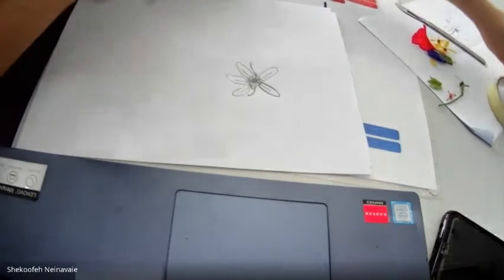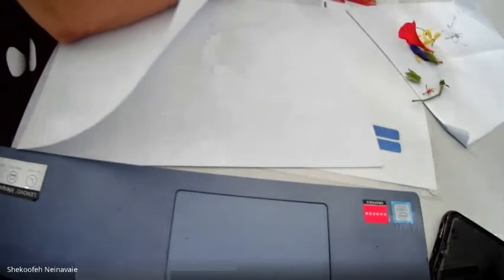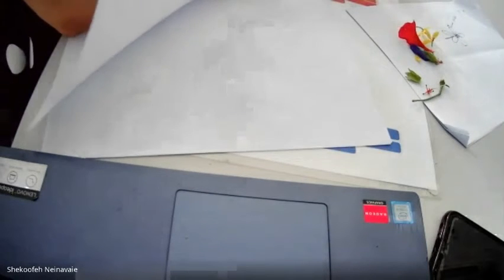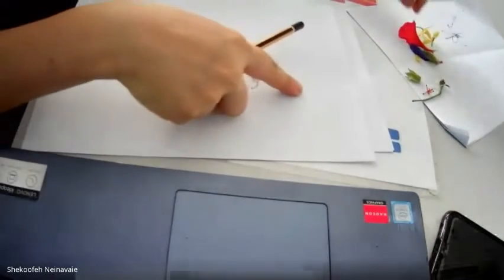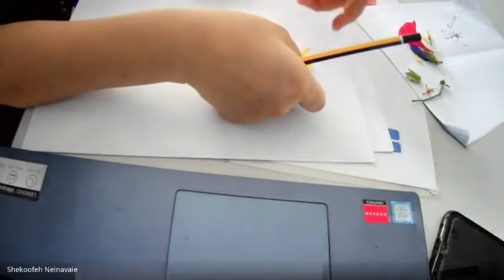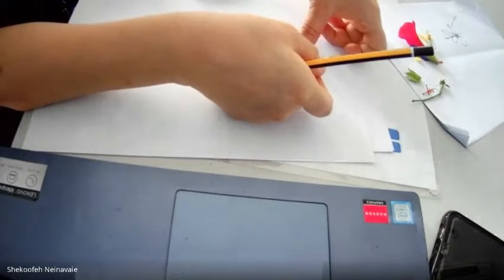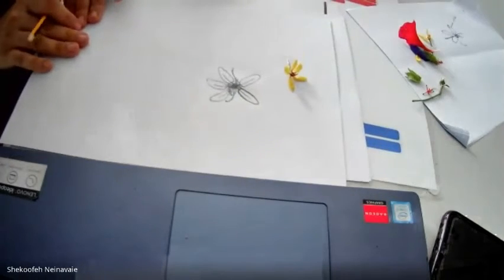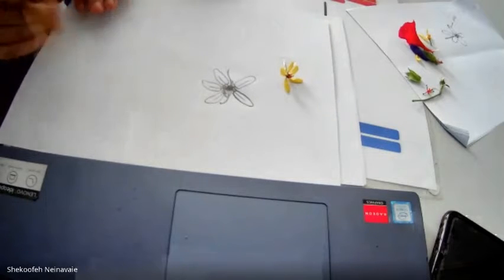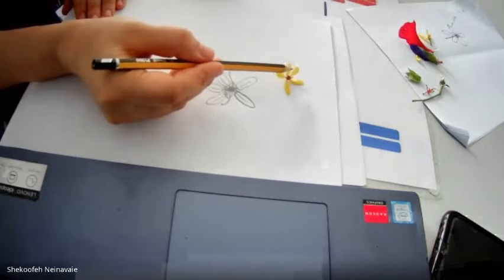I can put the flower on this paper, paste it on it, so we know which flower belongs to which drawing. These flowers have already been fertilized, because the pollen is gone and the flower is wilting. The petals are not that fresh, but this has happened recently. It's not so long ago.